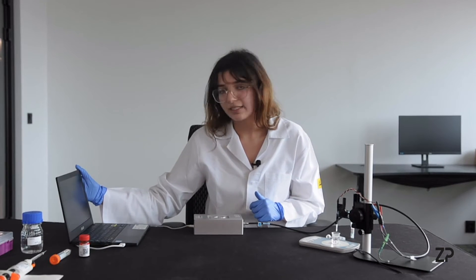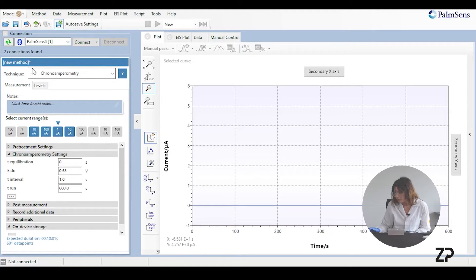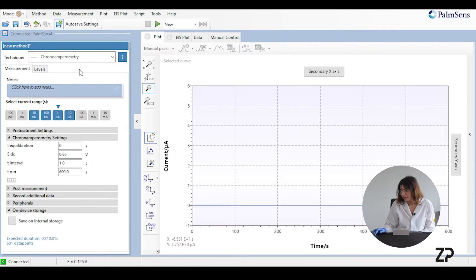First we want to set up the software, so I have PS Trace open just here. This says Palm Sense because inside our Anapot is the Palm Sense board, so we press connect. The technique we're using is chronoamperometry and the range we're running between is 10 nanoamps and 10 microamps, starting at the range 1 microamp.